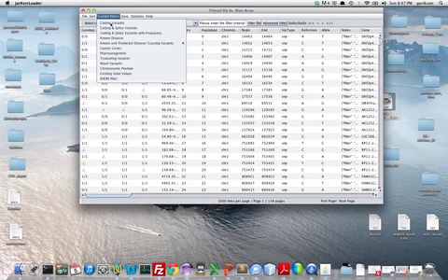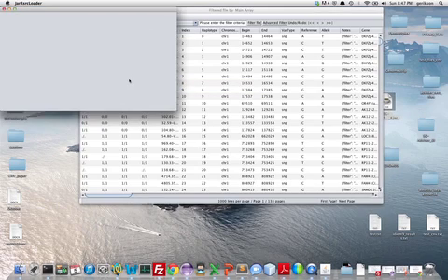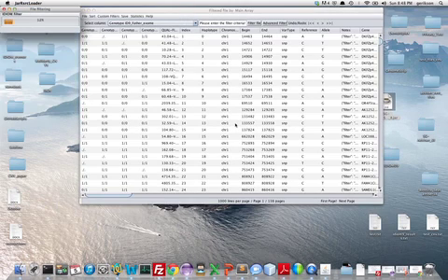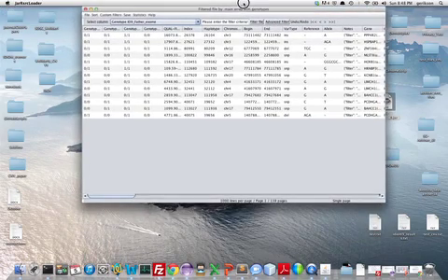on, for example, the IDIOM filter might be helpful. IDIOM finds all de novo variants, homozygous in child only, or compound heterozygous. IDIOM filter: father is unaffected, mother is unaffected, proband is affected, and sister is unaffected. Filter. And just a few variants.